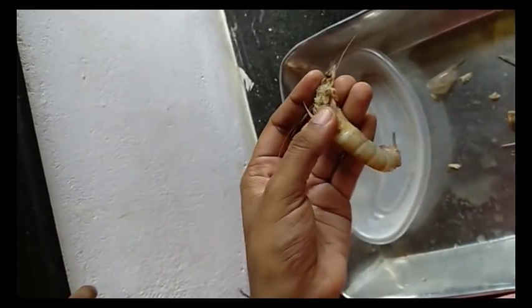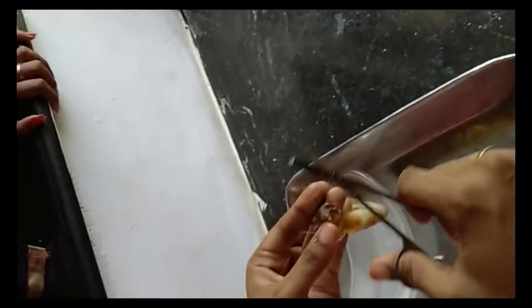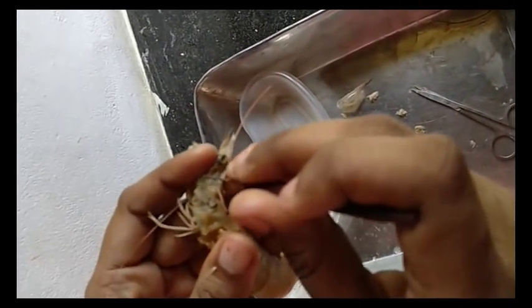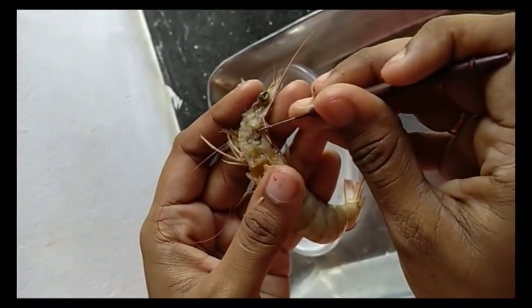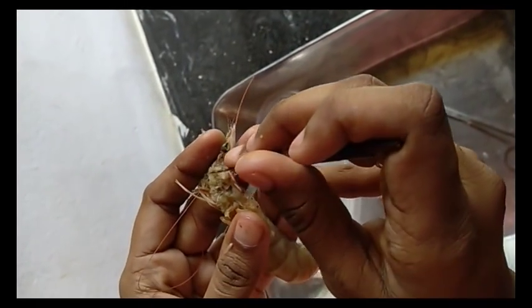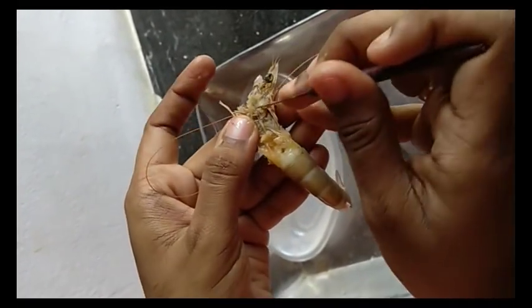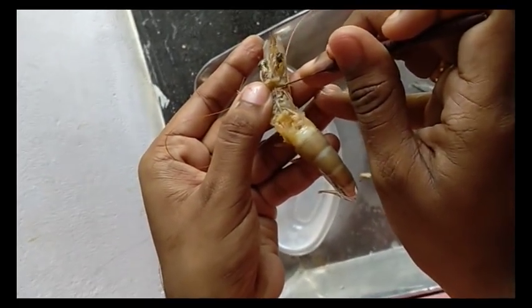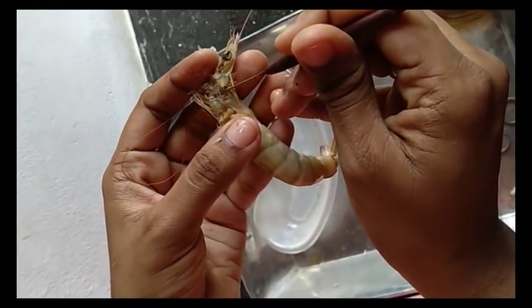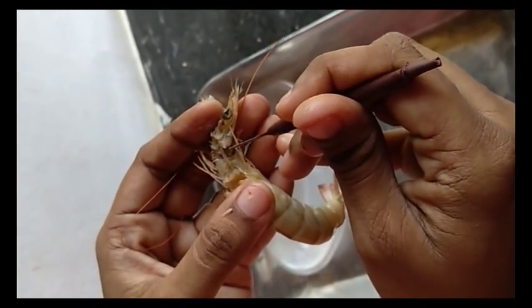If you clean it, you can see the circumesophageal connective. The circumesophageal connective is clear. Here, see it? Circumesophageal connective, two nerve cords joining the supraesophageal ganglion and the subesophageal ganglion. Here this is the subesophageal ganglion, and here above you can see the supraesophageal ganglion. Part of the esophagus, have to clean that.